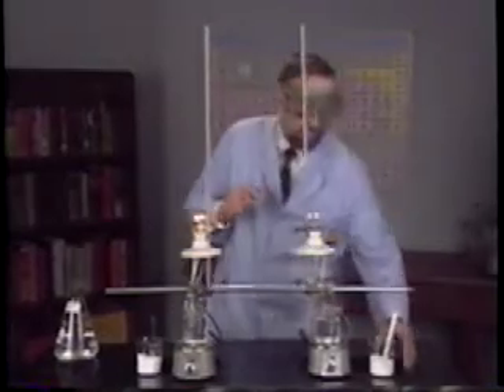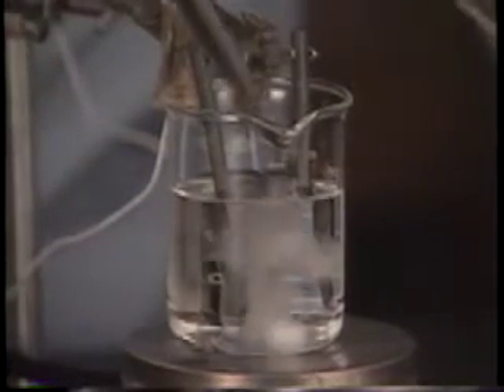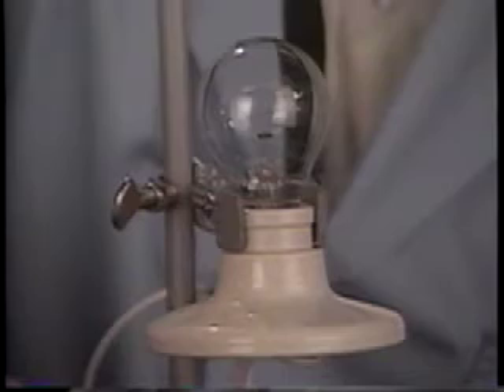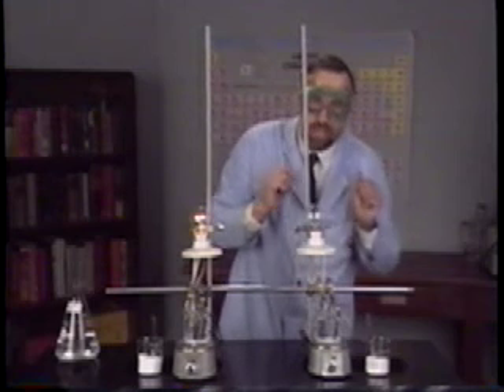Let's try white solid number two — looks pretty much the same. Put it in there. Nothing happens. Maybe a little more? Nothing. Solid number two does not conduct electricity.